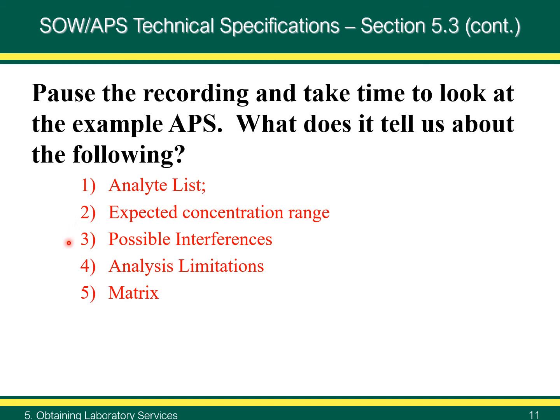Possible interferences are listed as fresh beta-emitting fission product nuclides if purification steps are inadequate or non-existent. Possible fission products include strontium-89, barium-140, lanthanum-140, and possibly yttrium-91 if less than 1 week has elapsed between active fission and chemical separation.